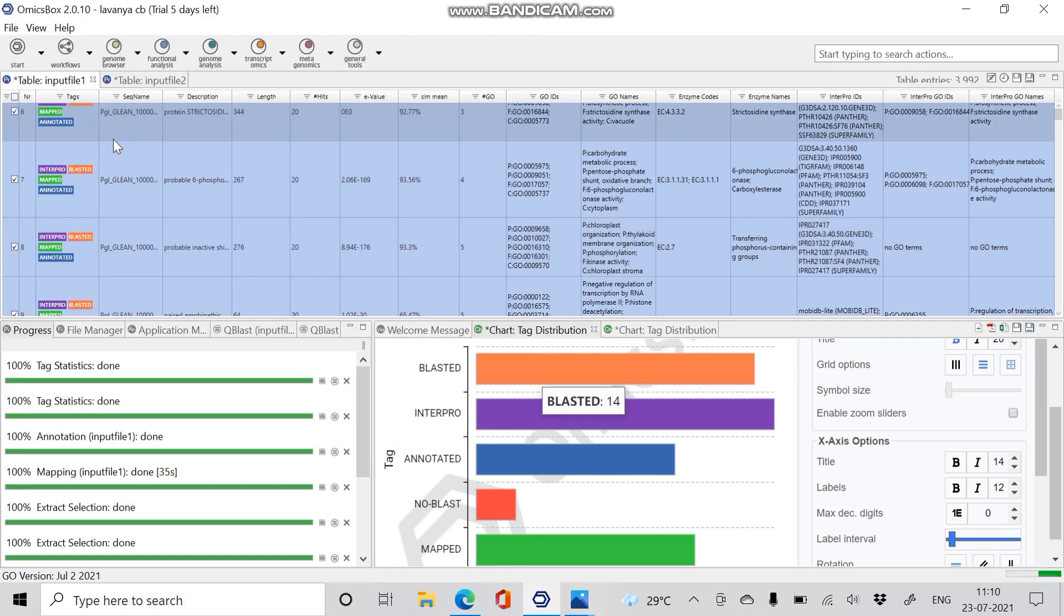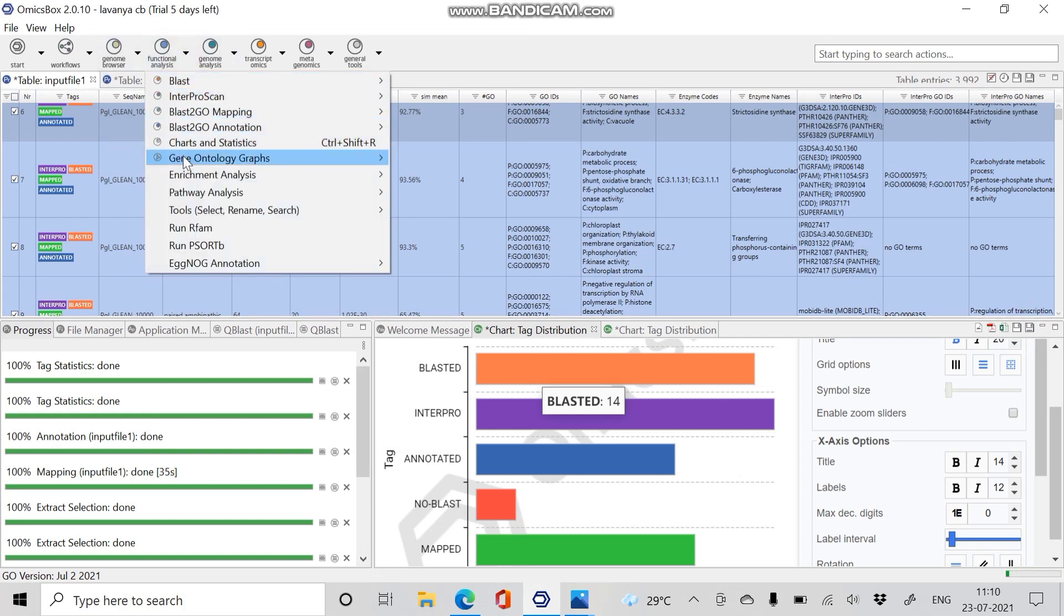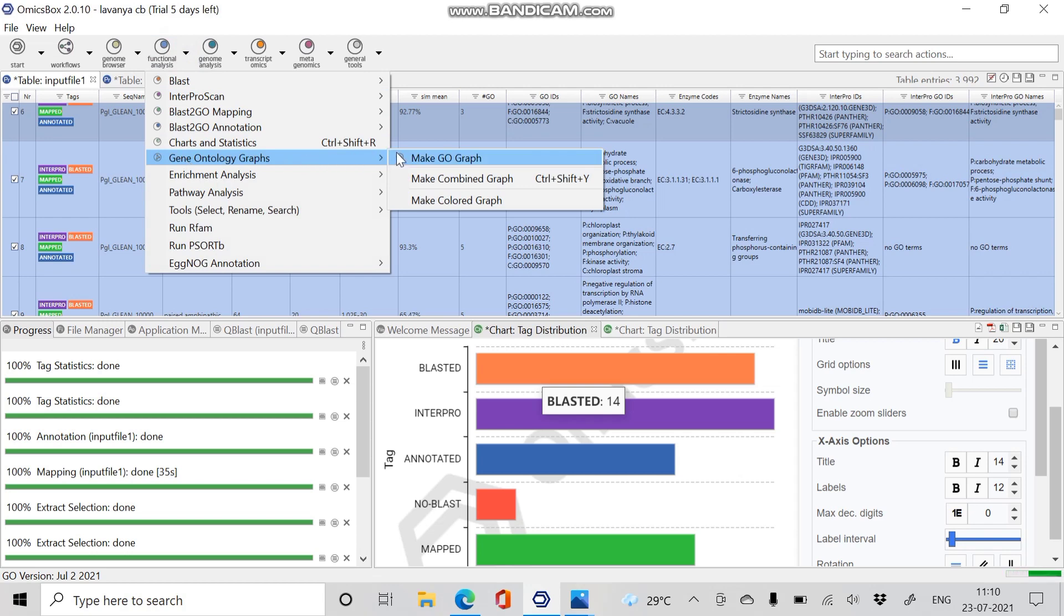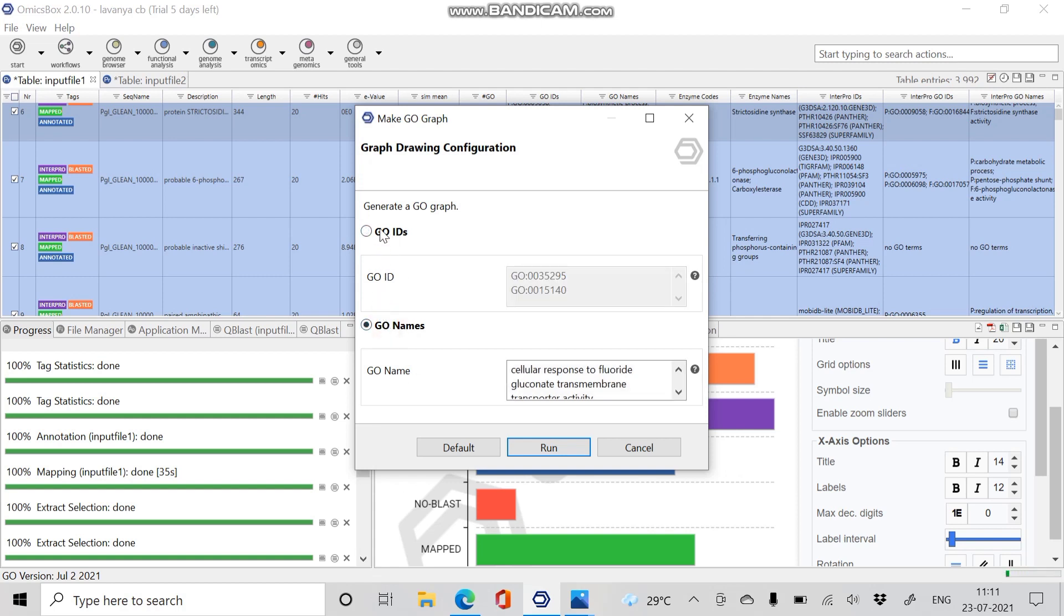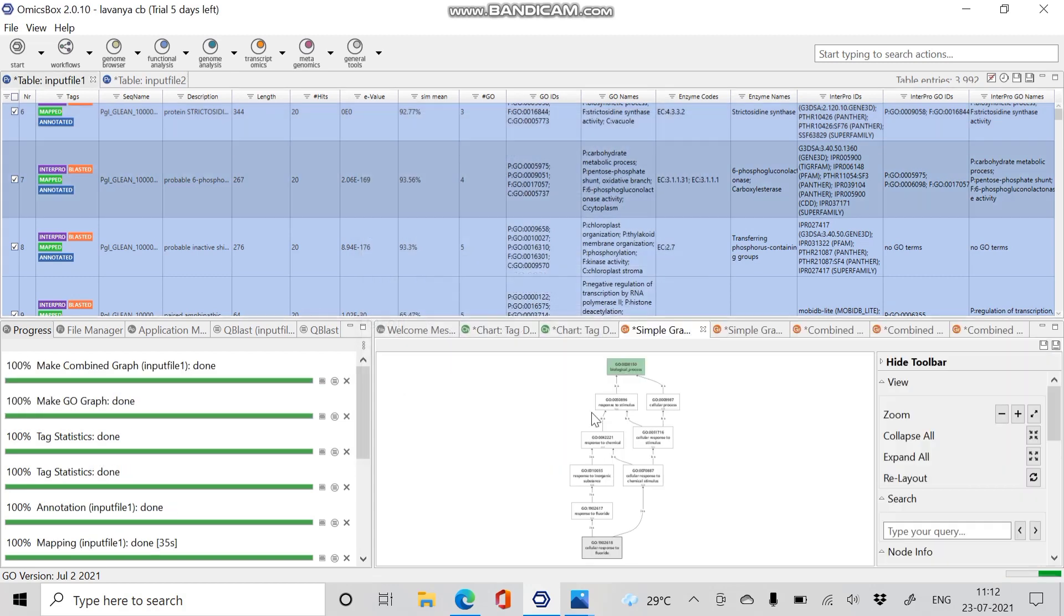Next we have to proceed with the GO graph. Click on Functional Analysis, select Gene Ontology Graphs, and give Make GO Graph. The graph drawing configuration page specifies how to generate the GO graph, based on GO ID or based on GO names. You can give either of your options and give Run. This is a simple GO graph based on the GO names.